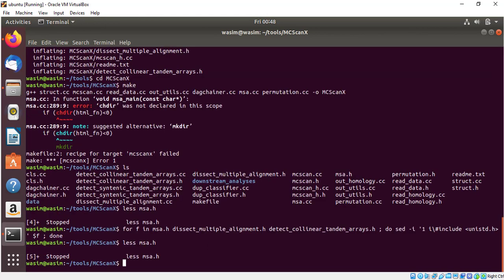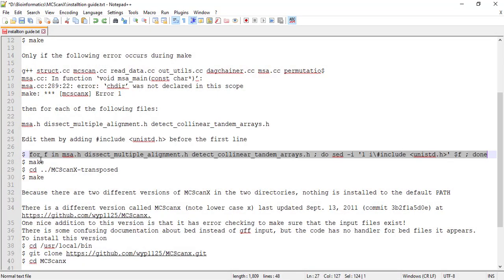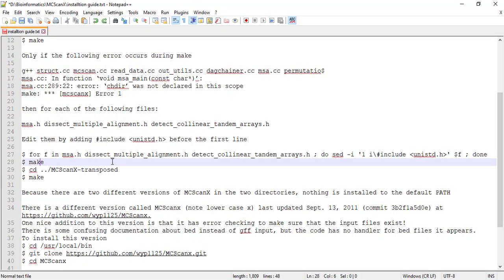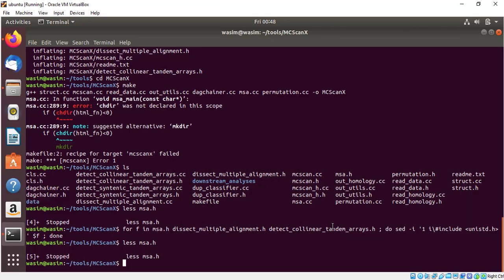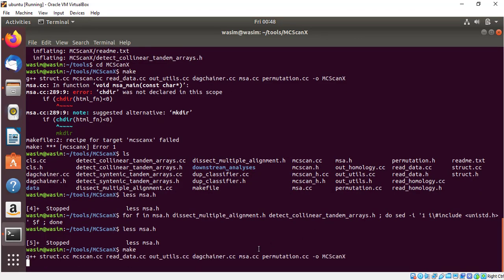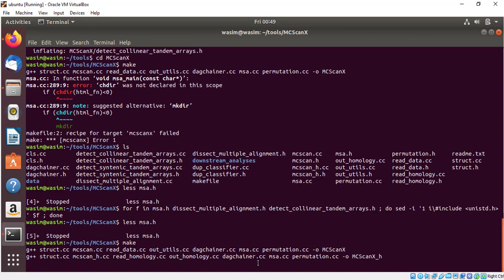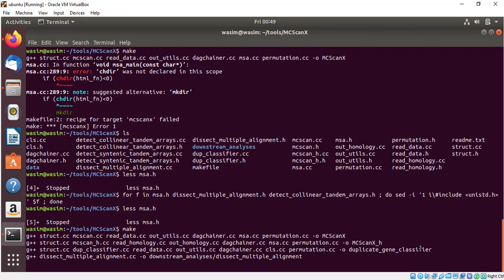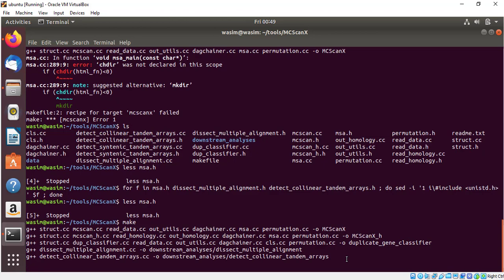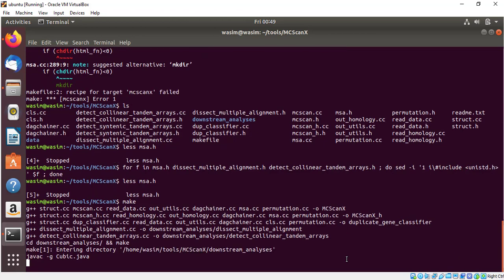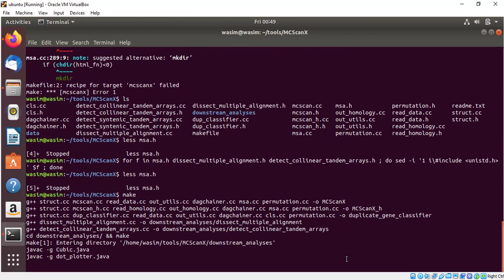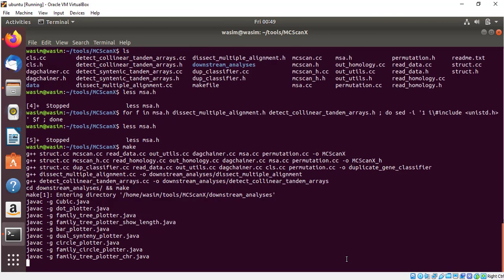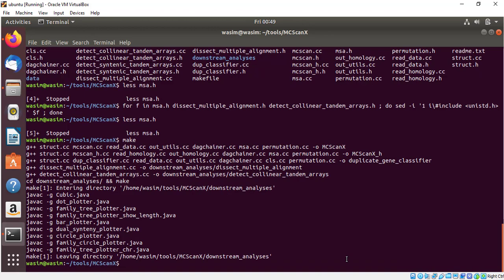Now again you will give the command make, click and wait for some time to install. This time you will see very different progress reports. Last time you can see you have seen some error, but this time it is working. Wait for this to finish. Now MCSCANX's installation is finished.